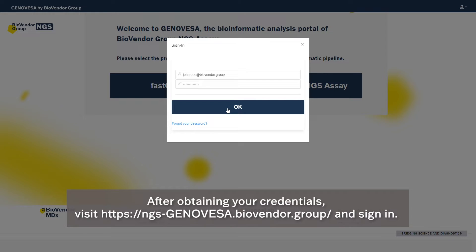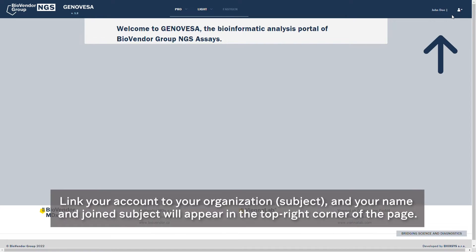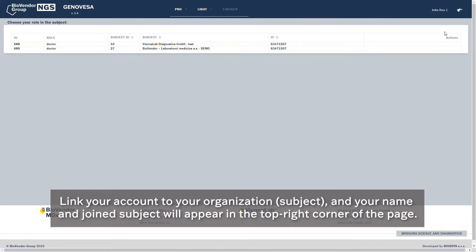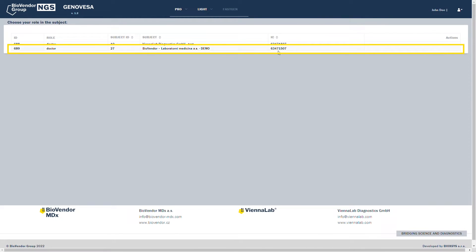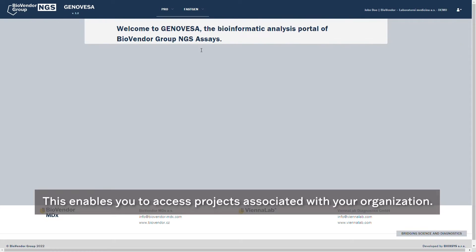Link your account to your organization and subject. Your name and joined subject will appear in the top right corner of the page. This enables you to access projects associated with your organization.